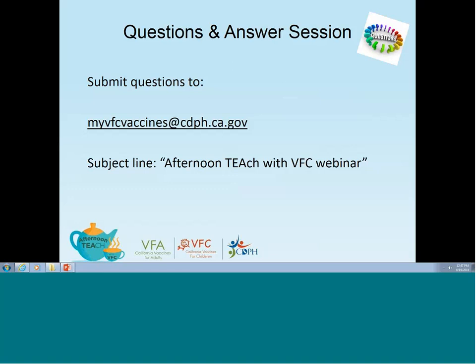Okay. And that's a perfect segue, Megan, because another thing that could happen is that maybe your alarms have been set up within the ranges of temperatures. So they may be set up within 36 to 46, and you will get an alarm that the temperatures are within range. Okay. So check your temperature setting as well. Okay, thank you. You're welcome.